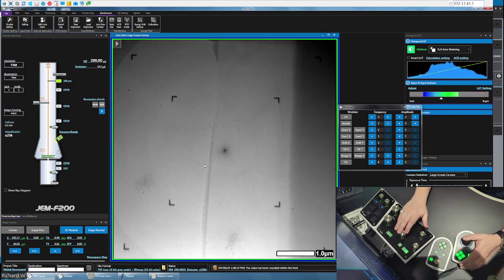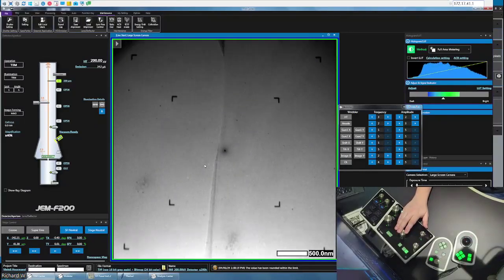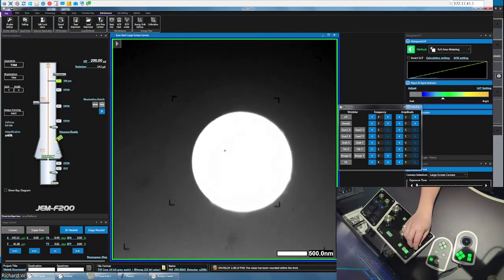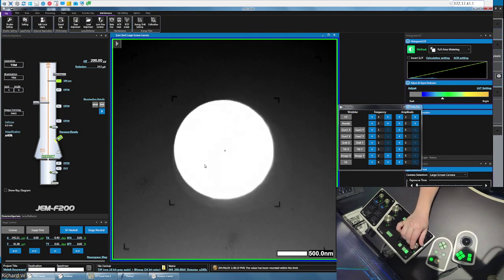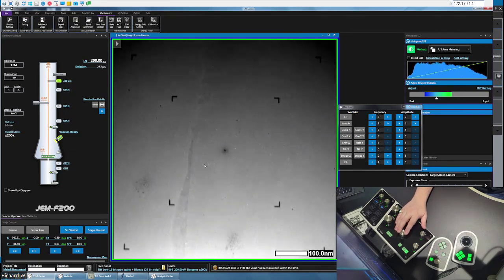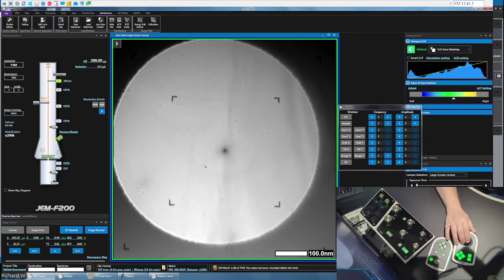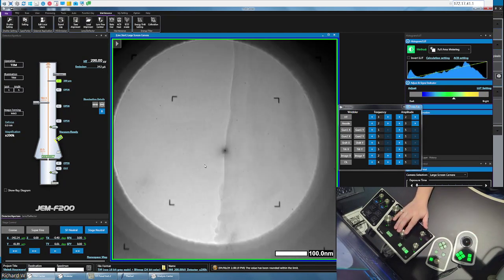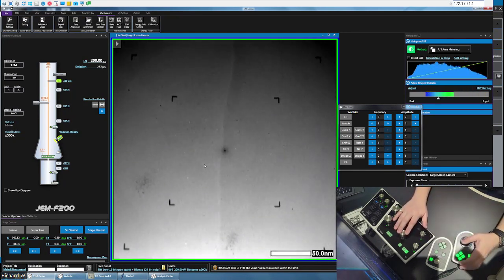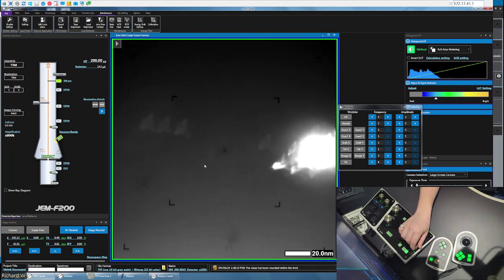So if we just start and try to do some high resolution TEM straight away, our alignment should be fairly good from the previous sample, apart from some damage. So this is a strontium titanate, which is just a single film.